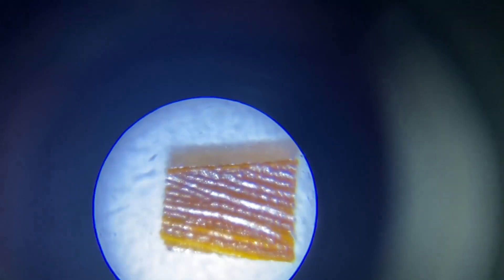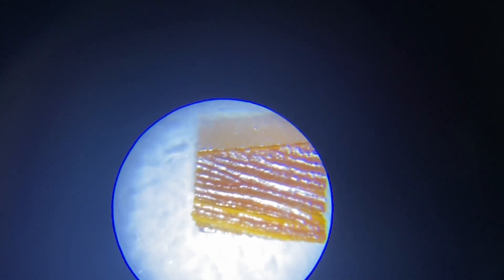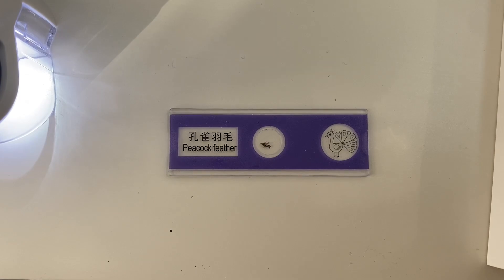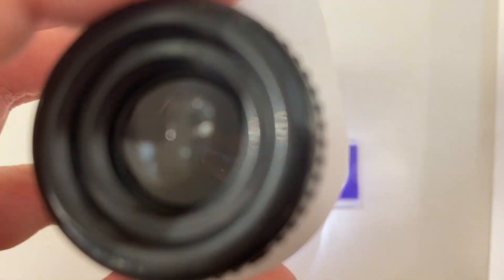Let's see if you guys will be able to see it. Here it is — you can see the wing of the cockroach. Now this is the peacock feather sample, let's test it out with the microscope.